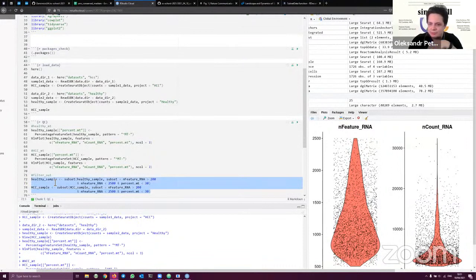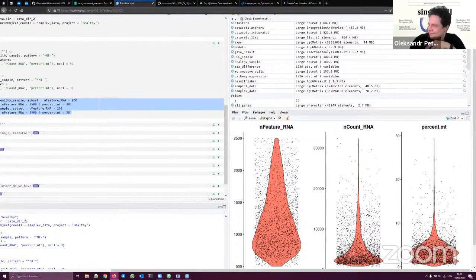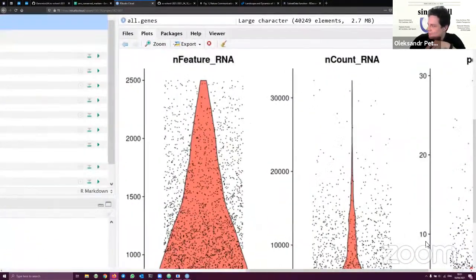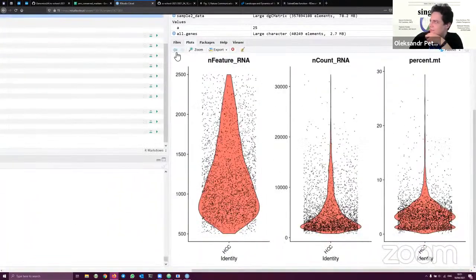A very good example in that case would be to look at the violin plots once more that we had. And on the right, you would see the %MT. As you see, you should take a cutoff that will have the major population of the cells that you would have in your sample, but remove the outliers that are on top, and that would probably be dead cells.